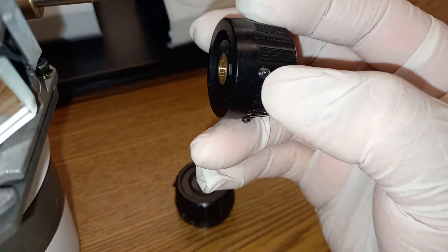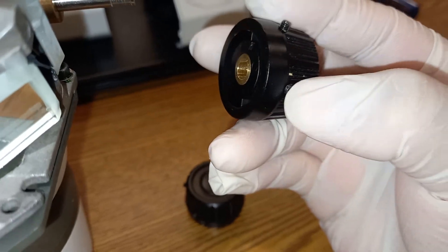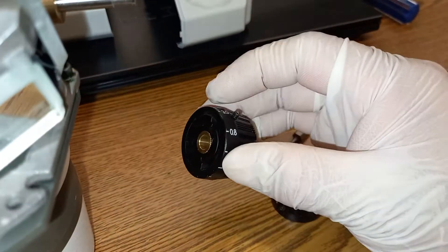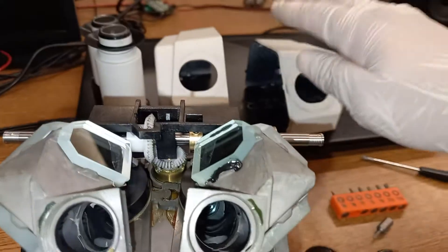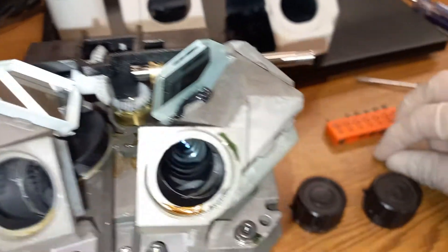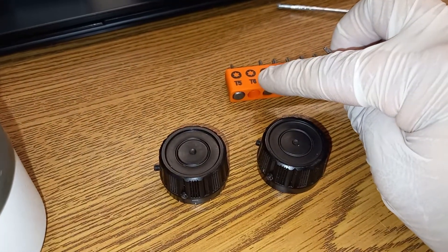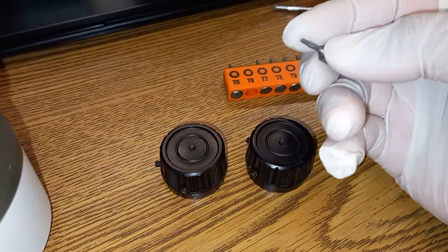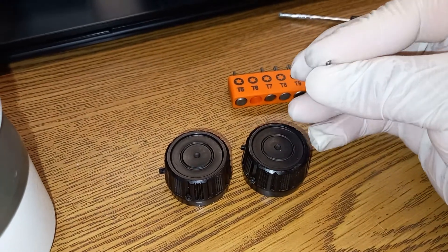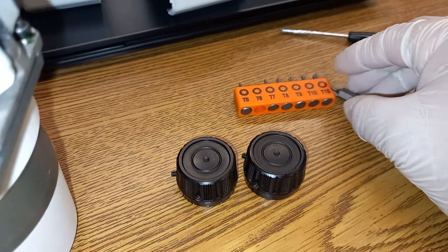You have here, for example, this knob. There are some tiny hex screws right here, and there are two of them on each knob which need to be taken apart before you can remove the housing of this microscope. In this case, I used a size T6, six-sided star bit. You can use this — it works really well.